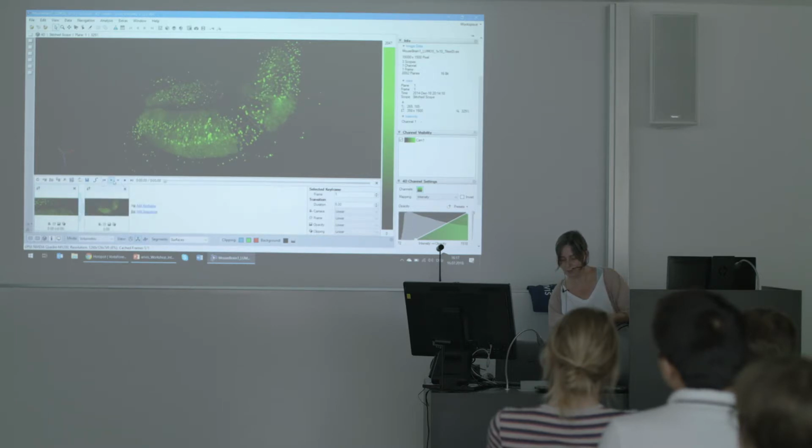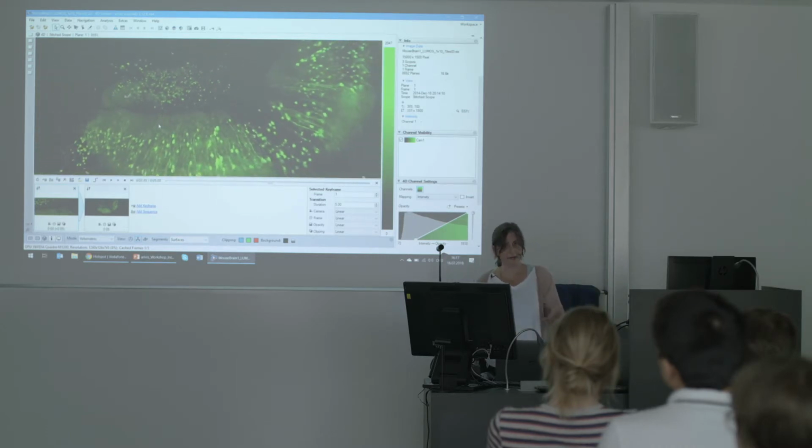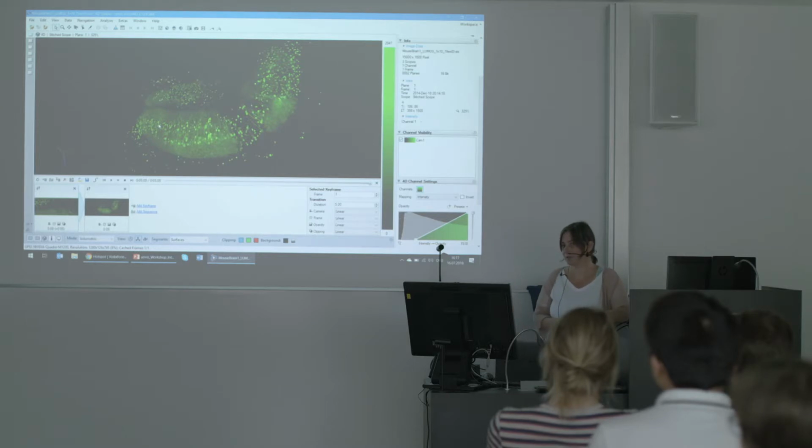I can preview what I want, and you see I'm of course setting up something. I would do this in a nice choreography, obviously, and then I could export this movie easily.